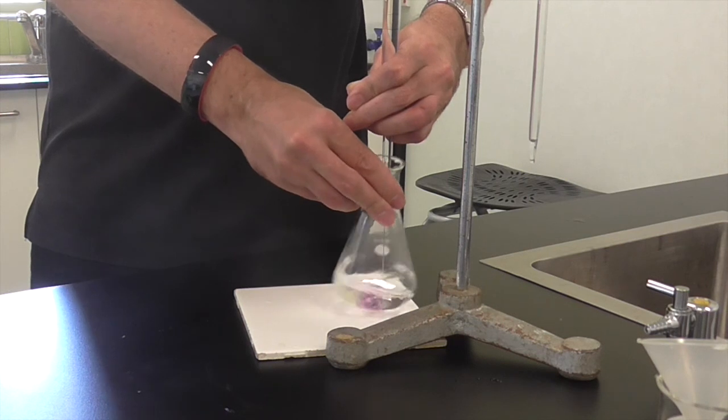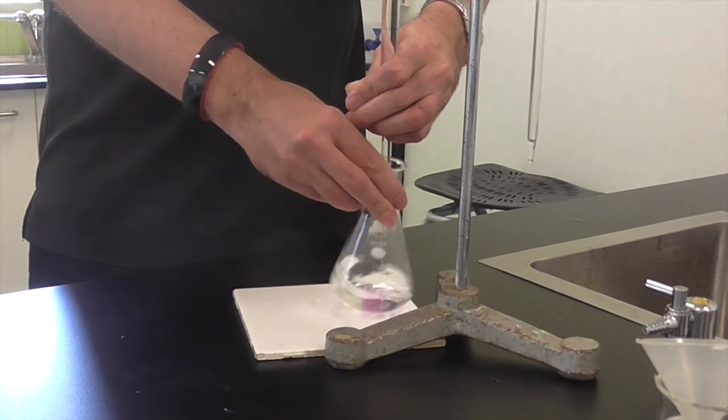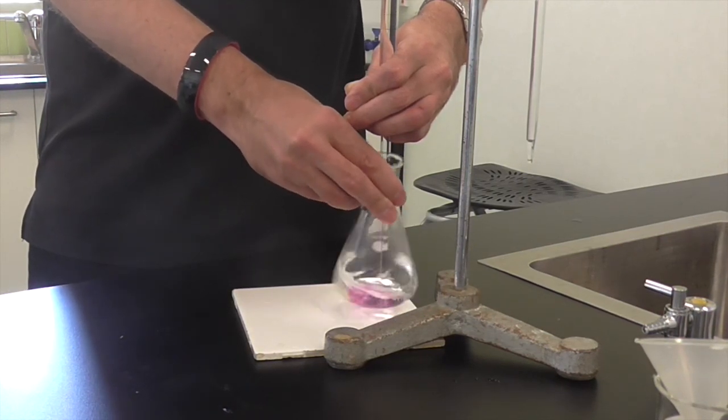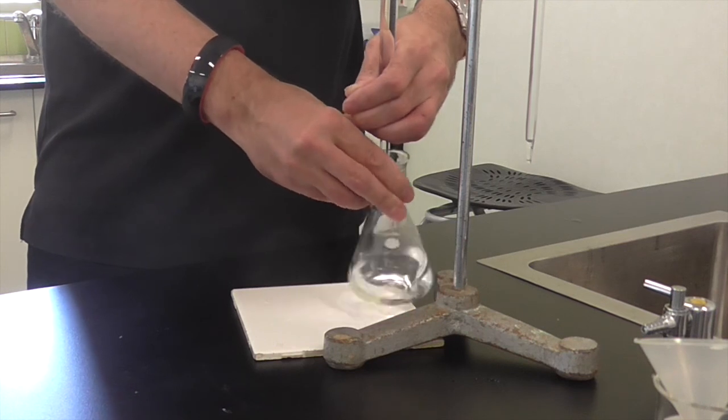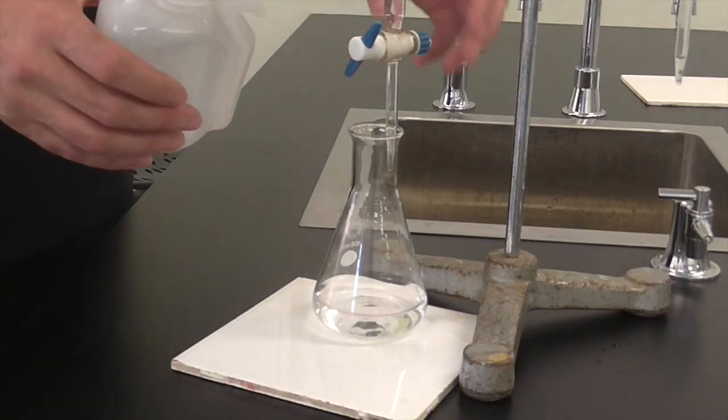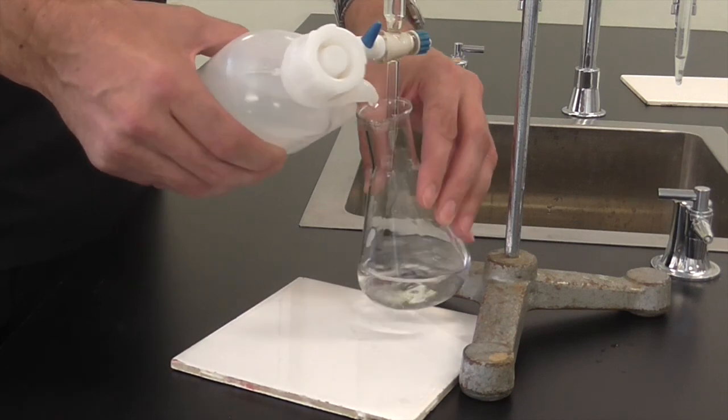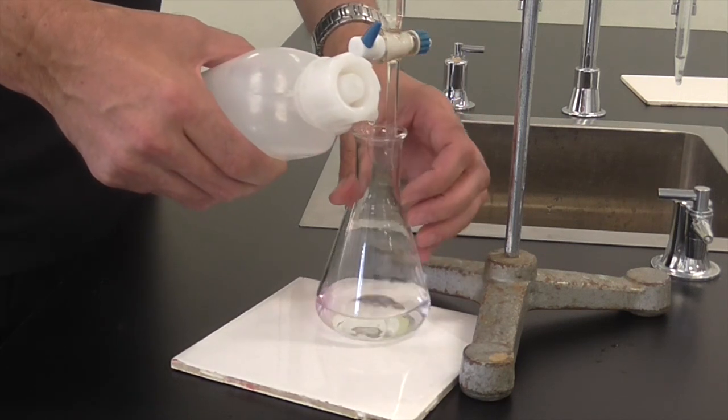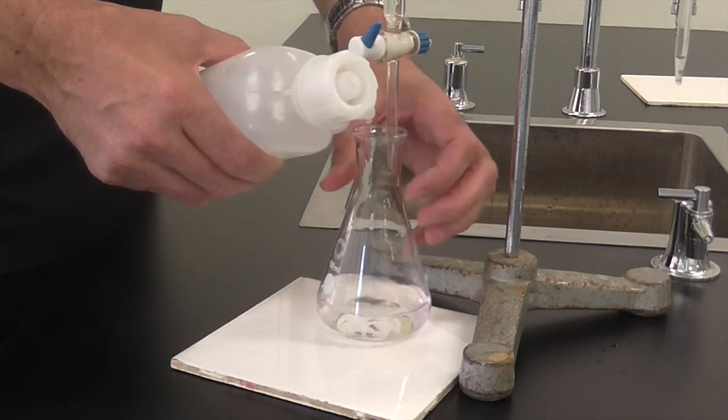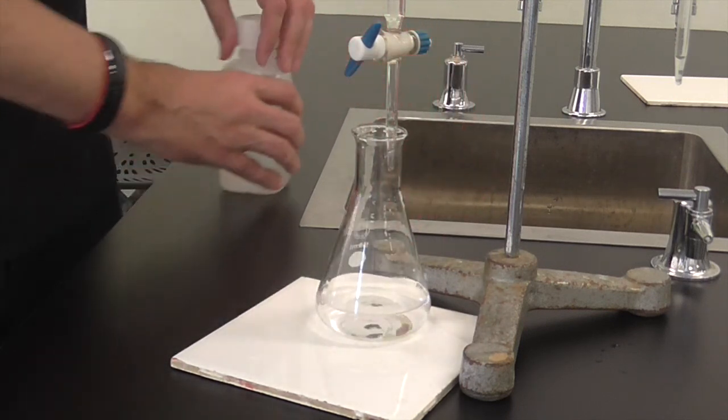Keep adding and swirling, adding and swirling, looking for the pink colour to start to hang around a bit longer before it disappears. As you get closer and closer to the end point, it's a good idea to rinse off the inside of the conical flask and the end of the burette to make sure that all the solution added from the burette makes its way into the mixture down the bottom.